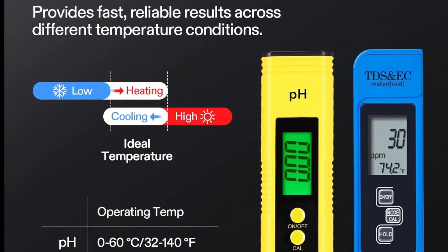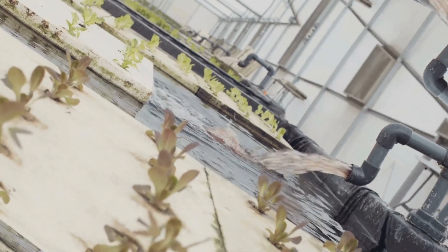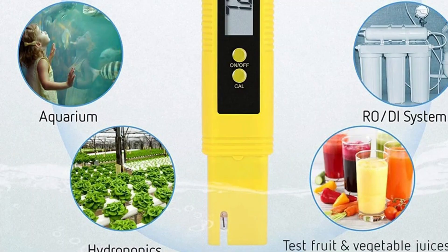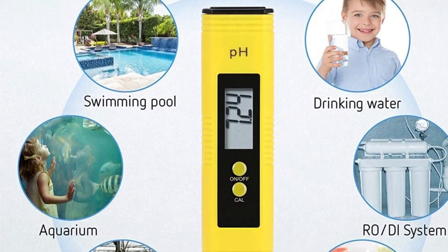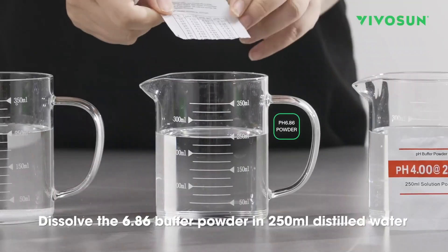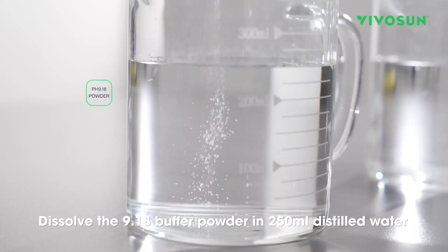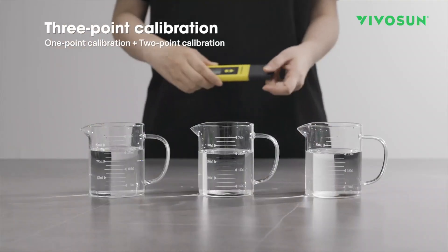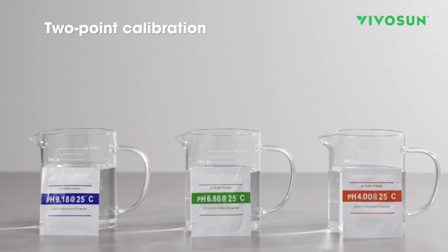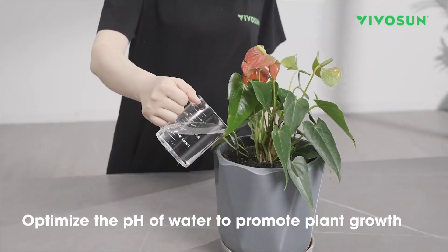Temperature is often an overlooked but crucial factor. In hydroponics, a water temperature that is too high or low can affect nutrient absorption and the oxygen supply to the roots. UL certification is a seal of safety and quality, giving you an additional layer of confidence in the product's durability and performance. Both meters have a pen-like design making them incredibly convenient to use and carry anywhere. Some users have mentioned that, like any precision meter, they require regular calibration to maintain accuracy, especially the pH meter — this is not a defect but standard practice to ensure reliable results.